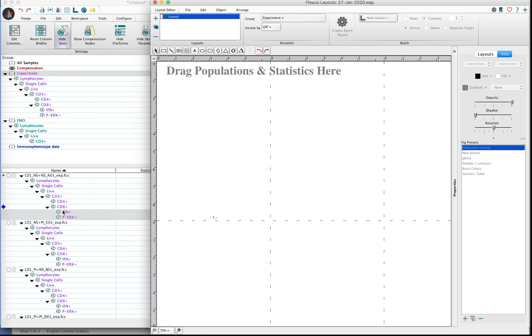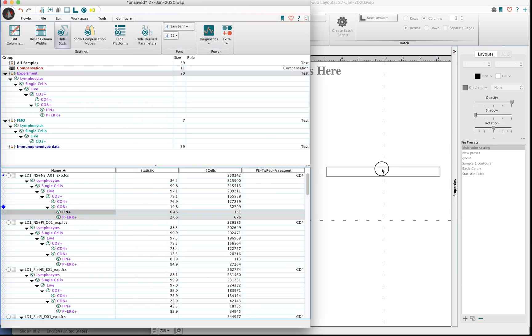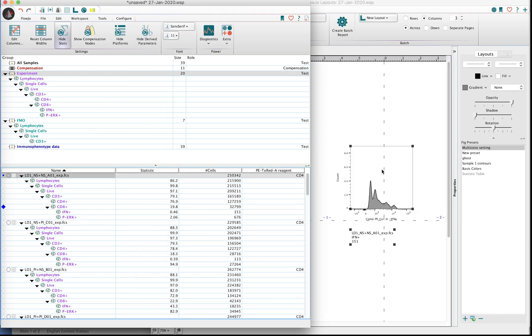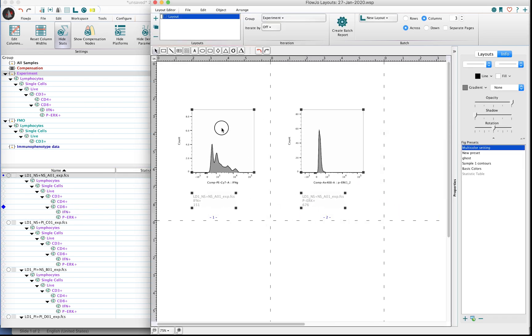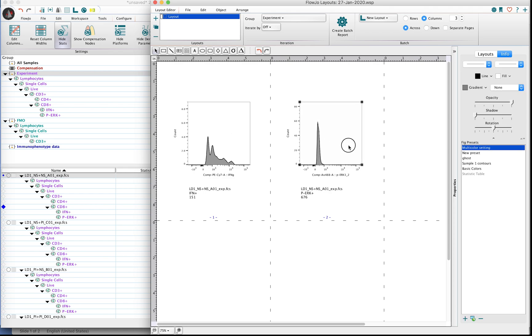For the Ancestry and backgating, you may want to work with your terminal populations, although it doesn't matter which populations you want to look at, just something that's down the chain a little bit. Drag those populations into the Layout Editor.